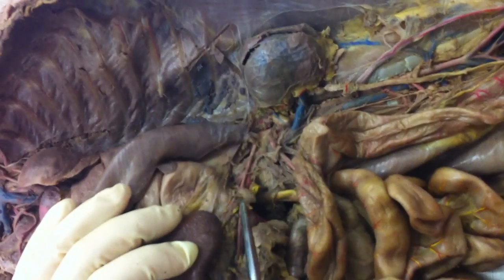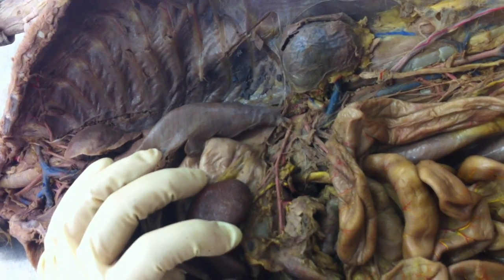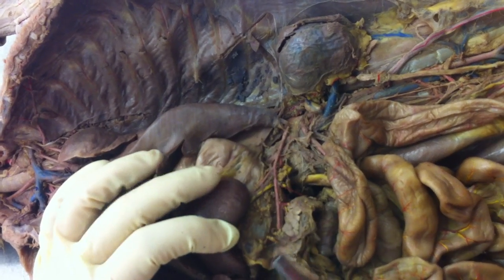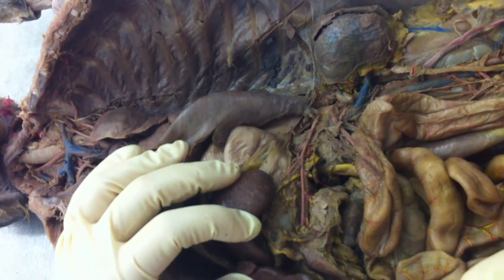The second one should be the gastric artery. Here's our stomach. Gastric artery. And this last one, in fact, if I pull on it, my broken spleen, you can see it moving there. That is the splenic artery. Okay? So you just have to know those by the order that you see them coming off.